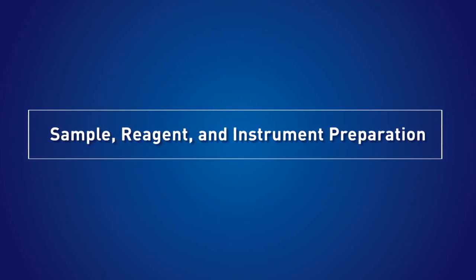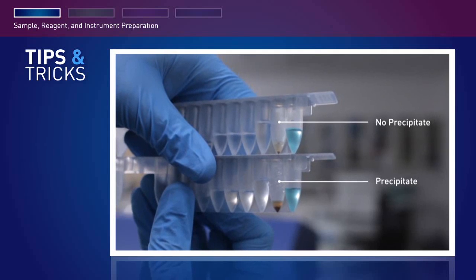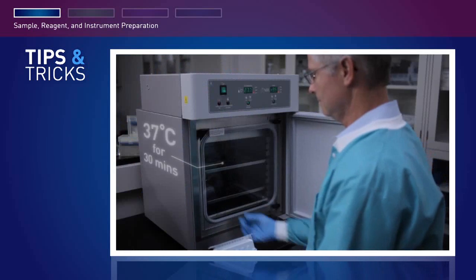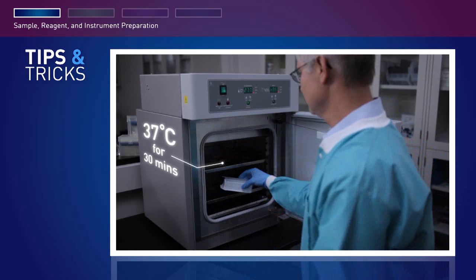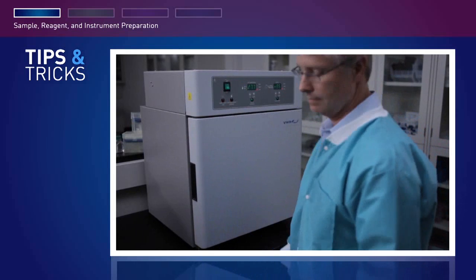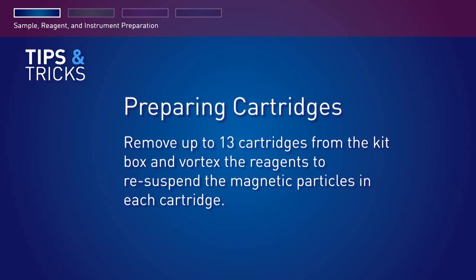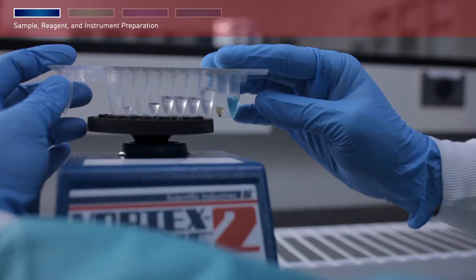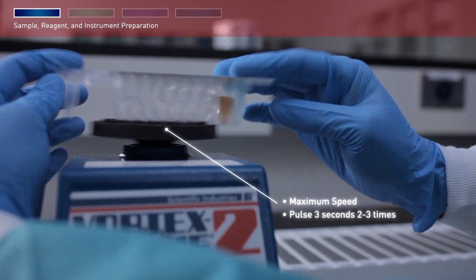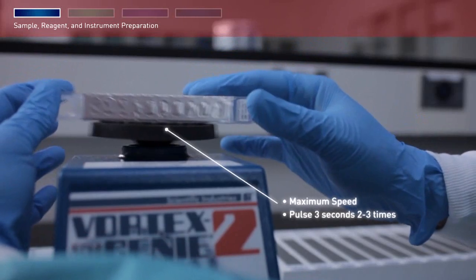Start with sample reagent and instrument preparation. If precipitate forms in compartments one or two, heat the lysis buffer and magnetic particle suspension cartridge in an incubator at 37 degrees for 30 minutes or until the precipitate is no longer visible. Heat only those cartridges that you plan to use that day. Remove up to 13 cartridges from the kit box and vortex the reagents to resuspend the magnetic particles in each cartridge. Hold the cartridge foil side up on a vortexer set to maximum speed, then pulse approximately three seconds, two to three times.